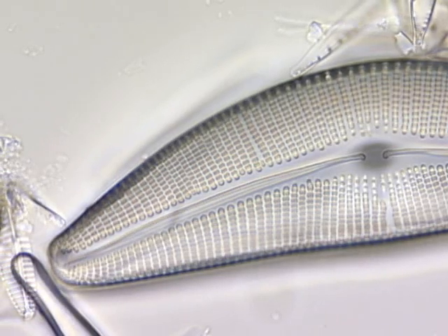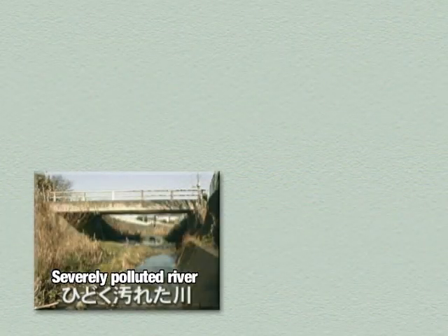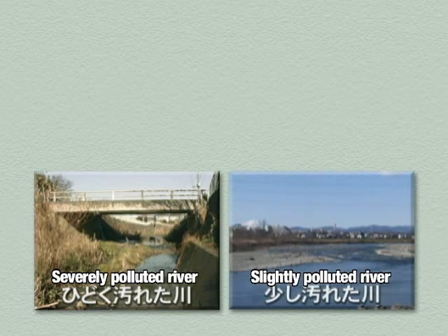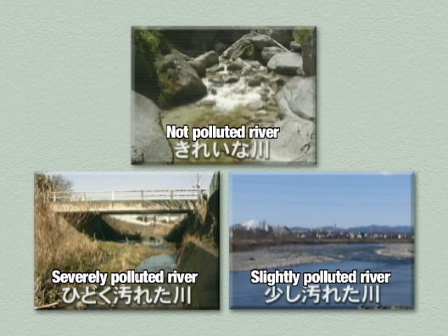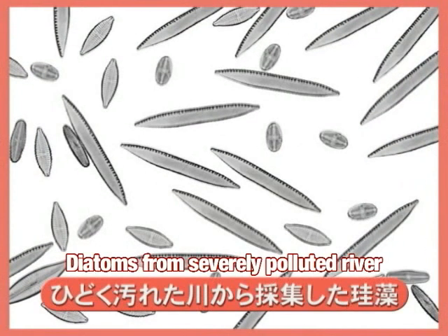And once again, in order, we will look at and compare the diatoms collected from the severely polluted water of the sewage canal, the slightly polluted river water, and the clean mountain stream water. First, we will look at the diatoms from the severely polluted water.